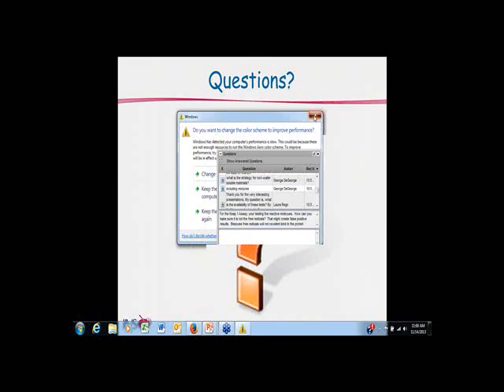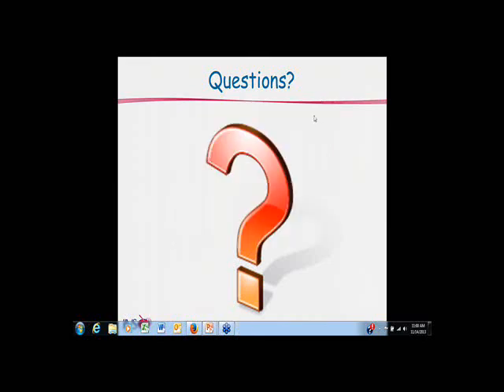Yeah. Well, I'm not totally up to date concerning the CRO services for the method, but I do know that there's an institute in Germany called Bioassay that has also participated in the validation study, in the ring trial study of the human cell line activation assay. So they offer the h-CLAT assay, and there's another, I think Harlan is offering the DPRA as well. But otherwise, there's more than that, but I'm not really up to date concerning the CROs.